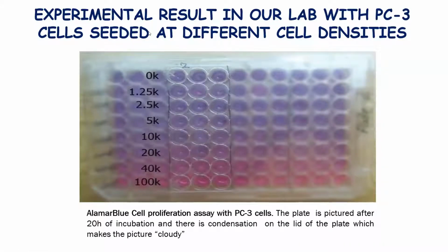Okay, so here you could see the experiment from the video, and this second triplicate, so 1, 2, 3, 4, 5, 6, 7, etc. So these guys were excluded from your calculation. I'm not really sure what is the reason.